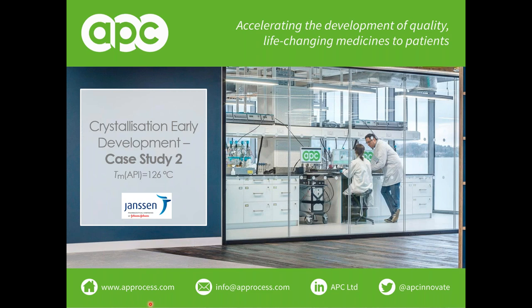Great. Thank you for this. One more great presentation. Thank you. I have a question about the COSMOtherm calculations. Earlier you said that because you got a good mesh, you were able to consider the DH results quantitatively accurate. What does a good mesh mean and how do you compare it to a not good one?